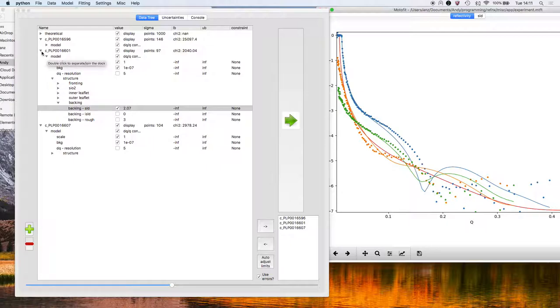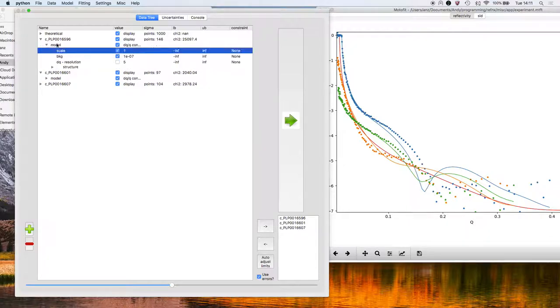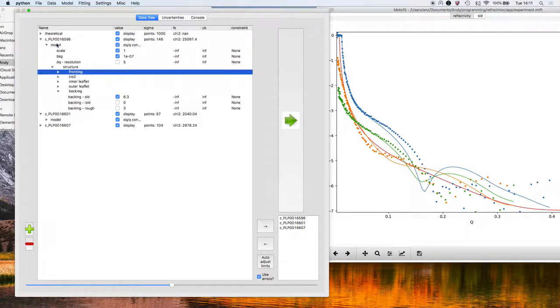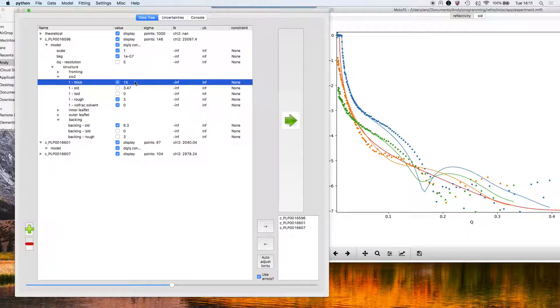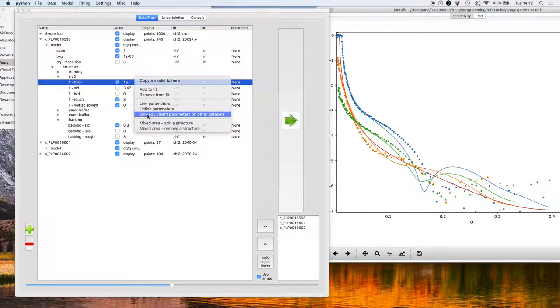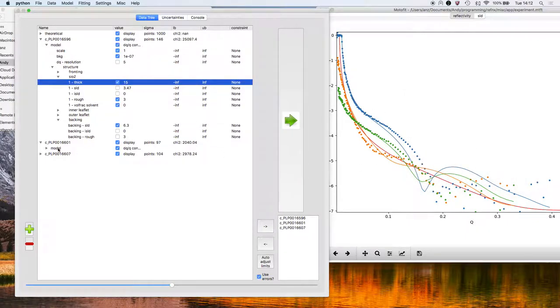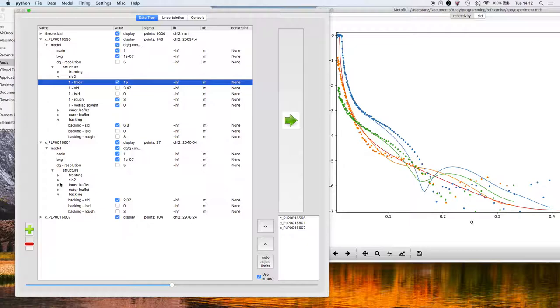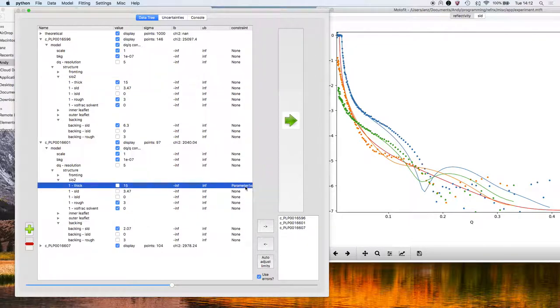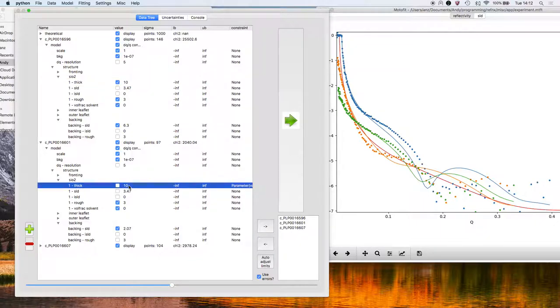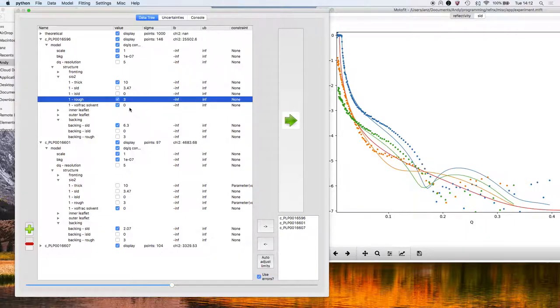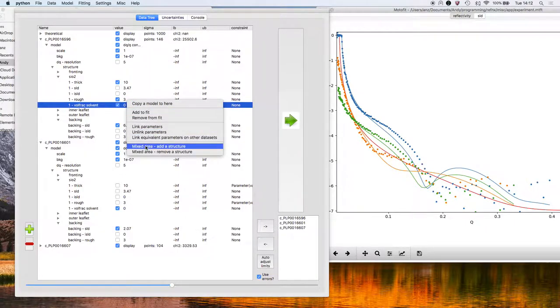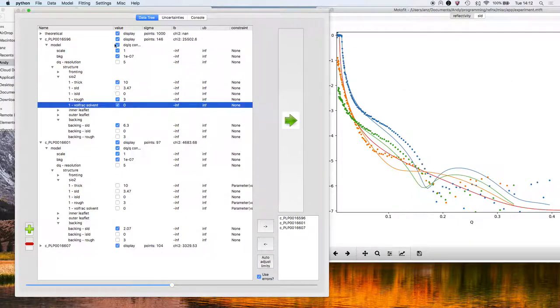The next thing to do is to go in and start increasing the amount of linkages across the three datasets. So if I go into the silicon dioxide, the thickness of the silicon dioxide should be the same for all three datasets. If I select that parameter, then right click and say link equivalent parameters on other datasets, and then select the datasets that I want to link across. If I then go into here, this thickness here for the silicon dioxide for the next contrast, you'll see in the last column that it has a constraint. So if I change the thickness to say 10, you can see that this thickness here has changed as well. We're going to do the same for the roughness. We're going to do the same for the volume fraction of solvent in that silicon dioxide layer.